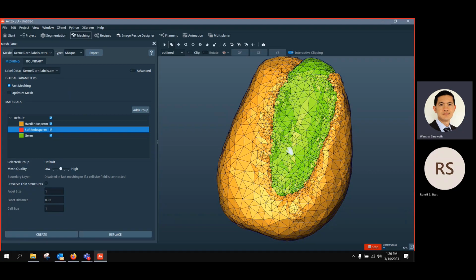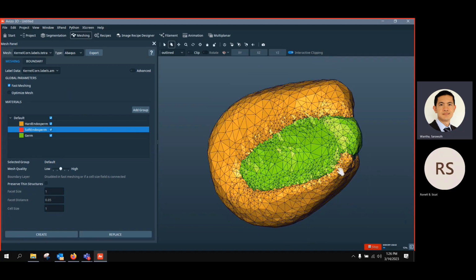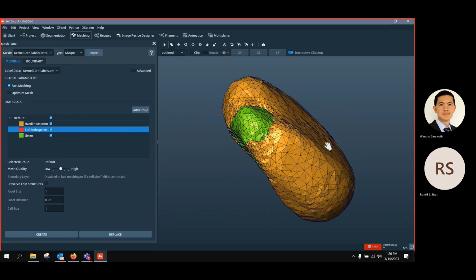not in the simulation that we did before, but we can do for DVC, digital volume correlation, so that we can generate the mesh and then start to simulate the strain propagation, strain map and displacement map, using the tetrahedral mesh. So for example, now we generate a mesh, you can select the mesh and export to any solver that's available here. Mostly Abaqus, ANSYS, COMSOL, Fluent that people use a lot.